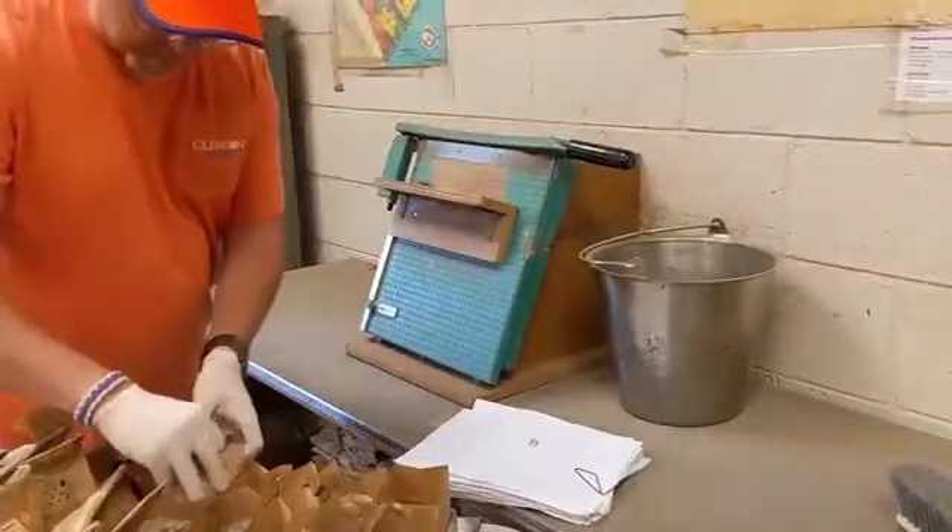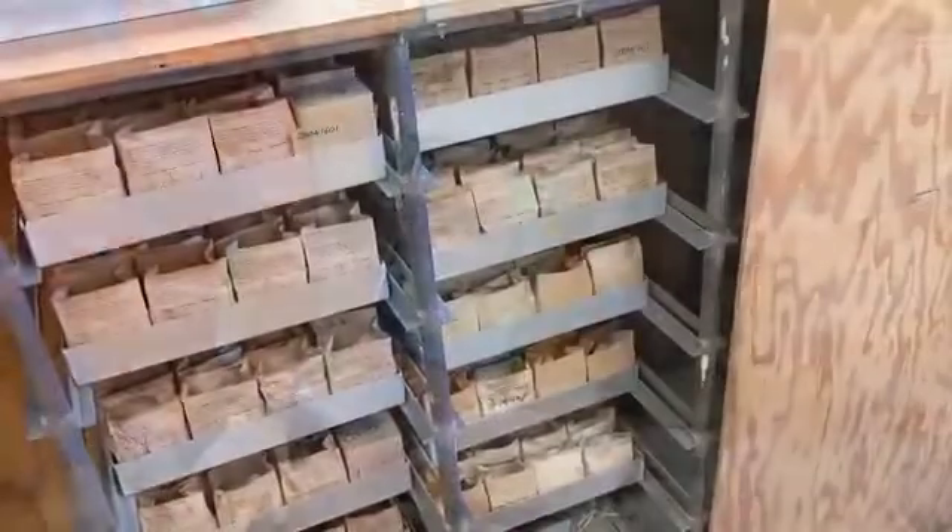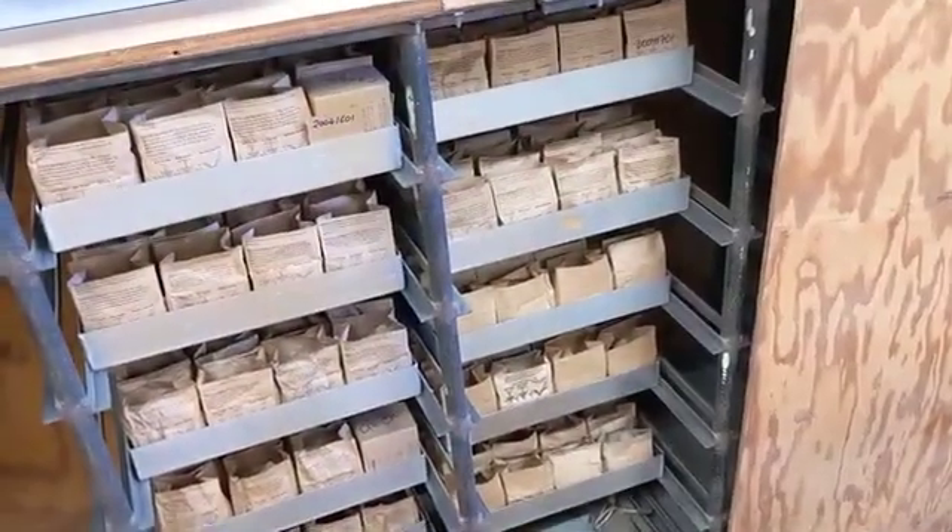The top of each soil bag is chopped off. Then the samples are placed in the oven to dry overnight.